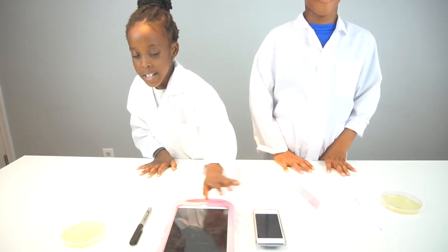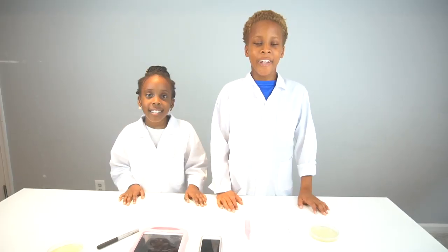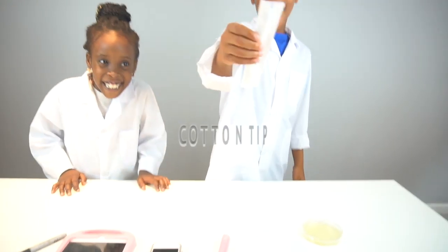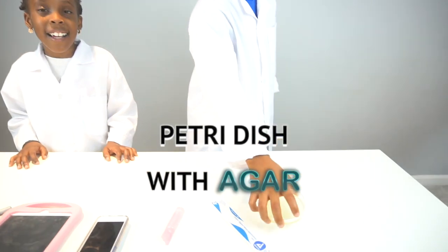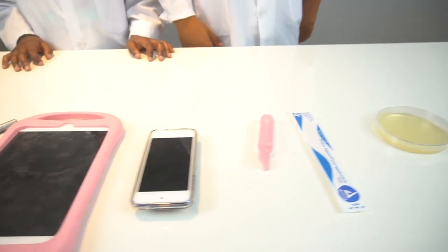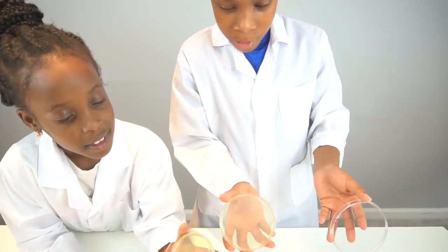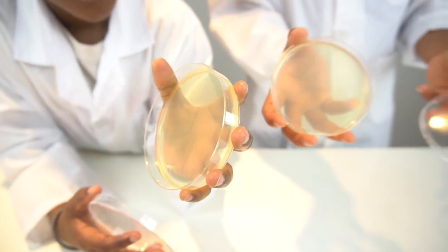For this experiment you're going to need the stuff that you're testing, then a marker to label, saline, a cotton tip, and a petri dish with agar. Agar is the sticky stuff in here, which is also like bacteria food, which will help the bacteria grow.